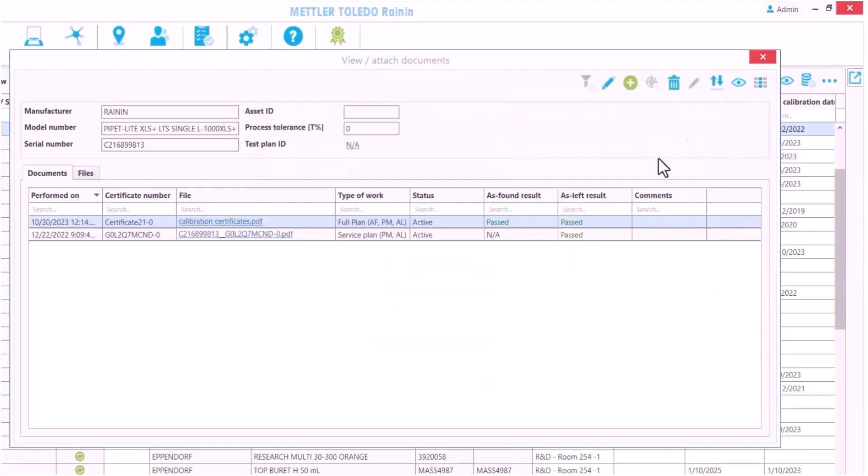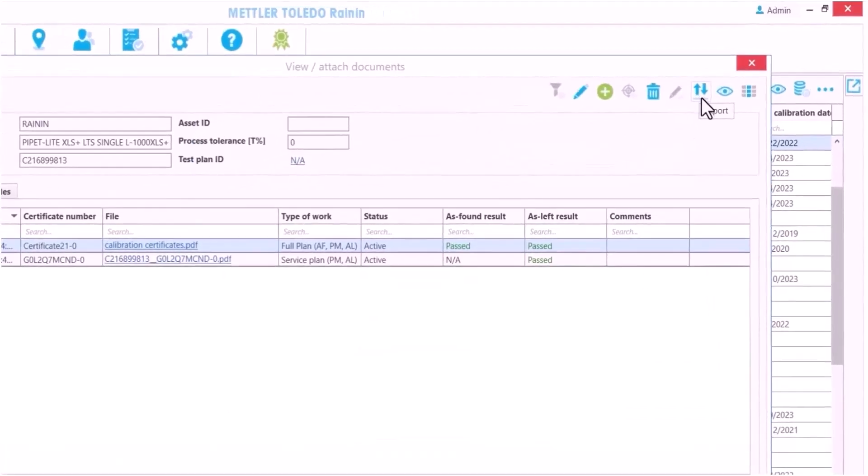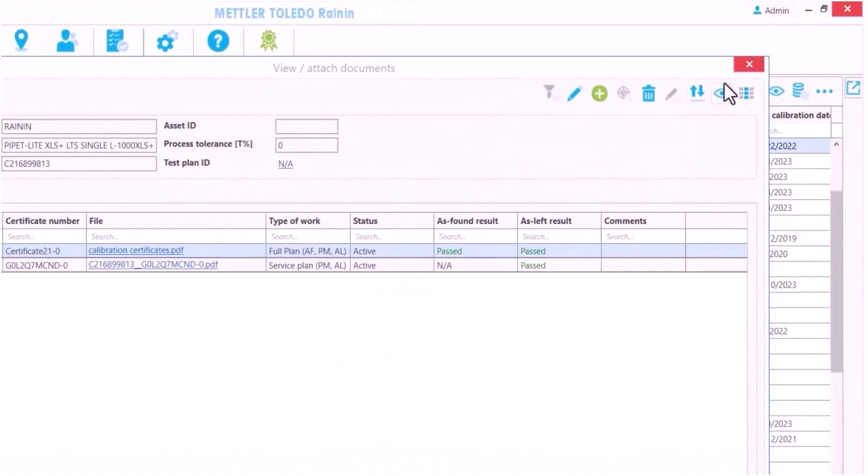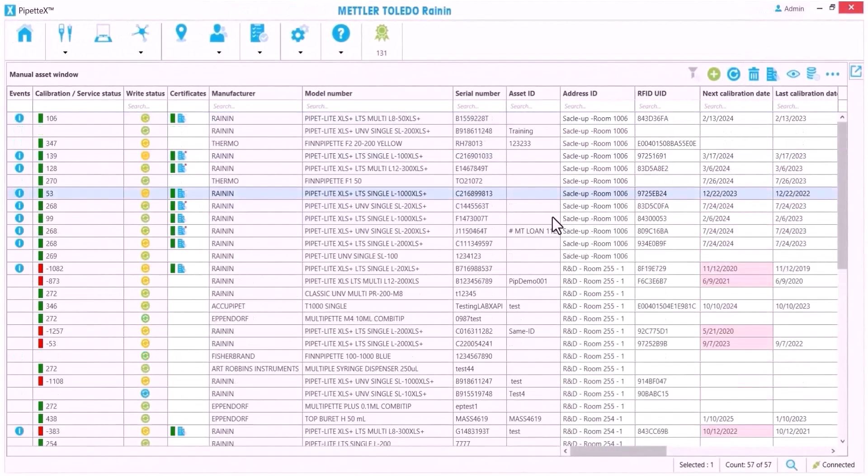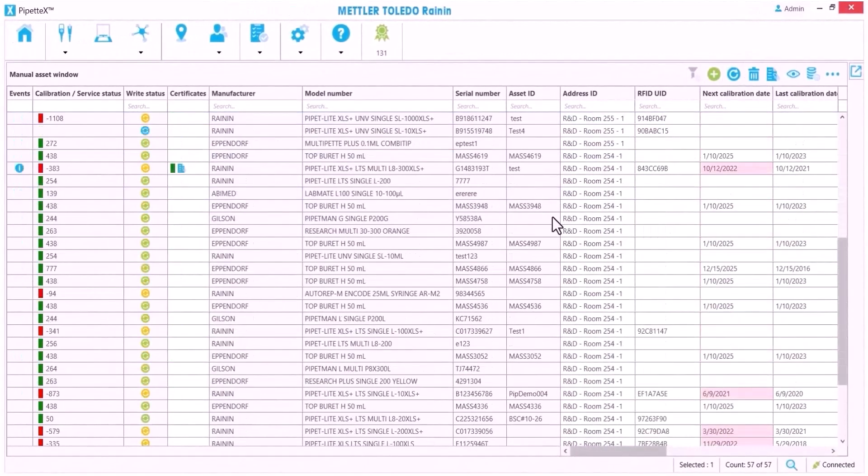And I can export any of this if needed. This is just a quick sampling of what Pipette X can do to simplify managing your pipettes.